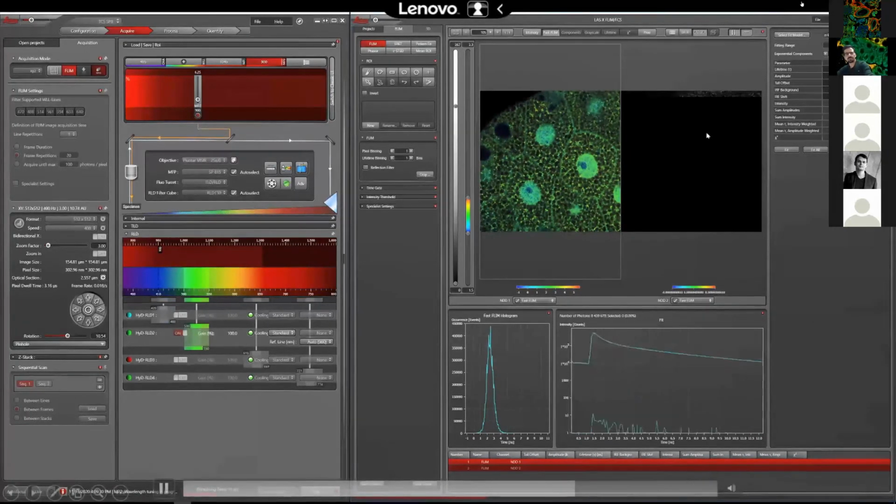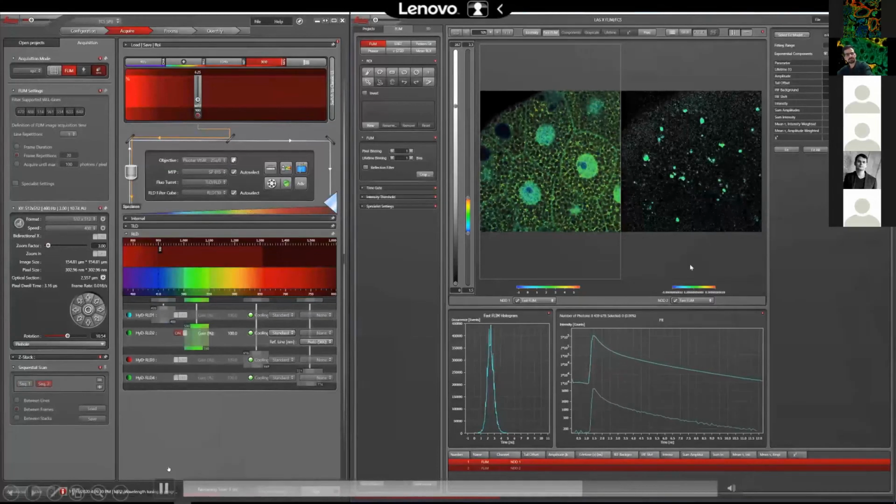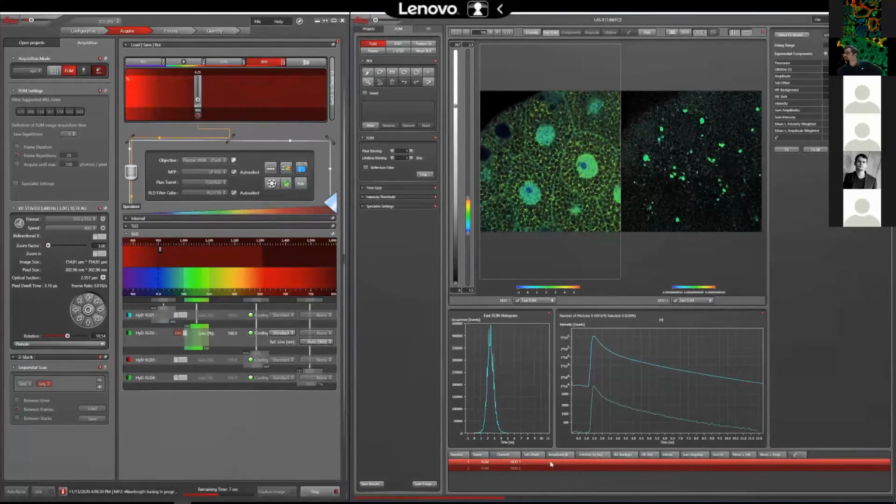We have a good question here as well regarding the binning. Sandra is asking: binning the pixels would help to increase the signal but lower the resolution. However, quite often the lifetime within a certain region of interest should be determined. Then the photons within the ROI are summed up, reducing the need for many photons per pixel and longer acquisition time. The photon number is mainly critical for pixel-wise binning. Thank you very much, Sandra.